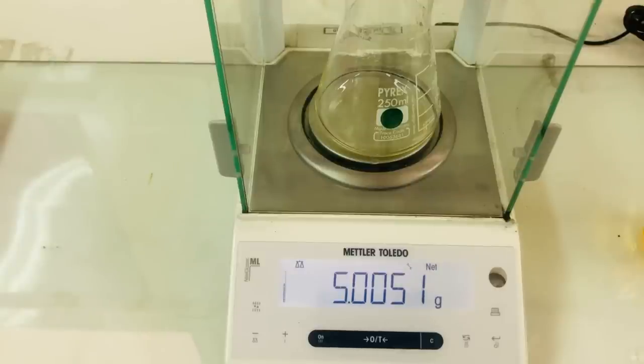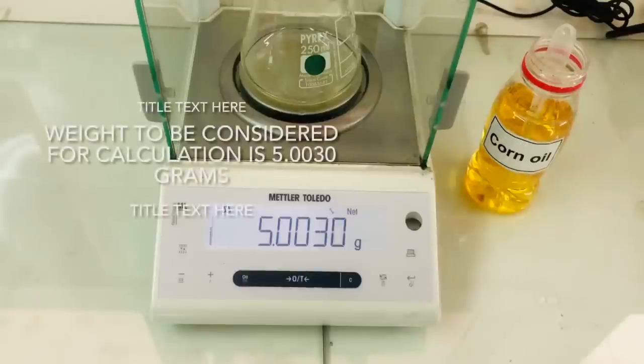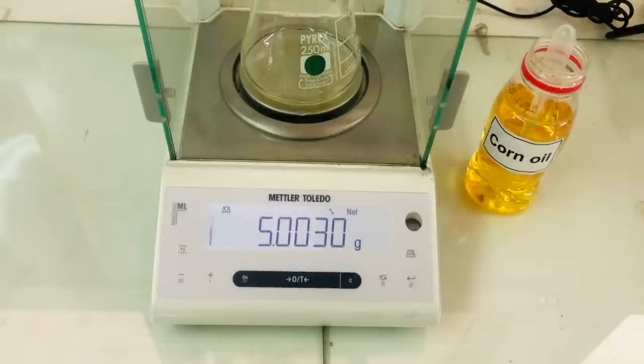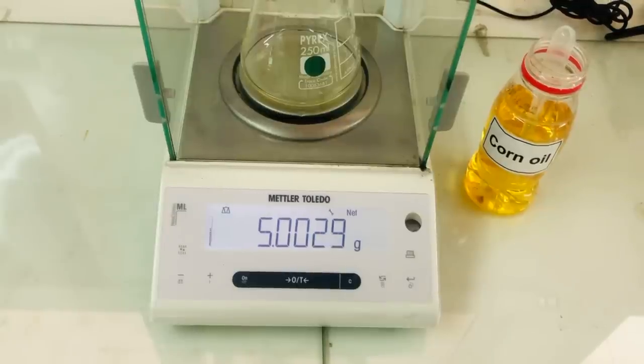Record the weight, which you can see over here. It is exactly 5 grams of the oil sample. You can see we have weighed exactly 5 grams of the oil sample. Record the exact weight of the sample.